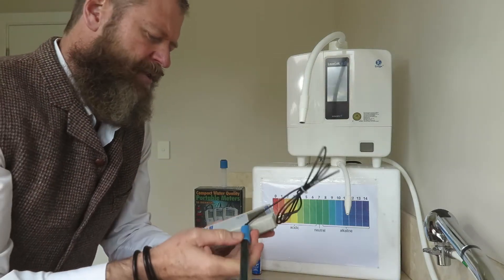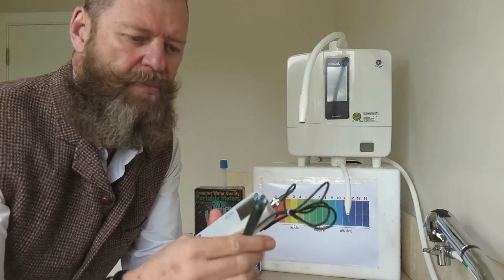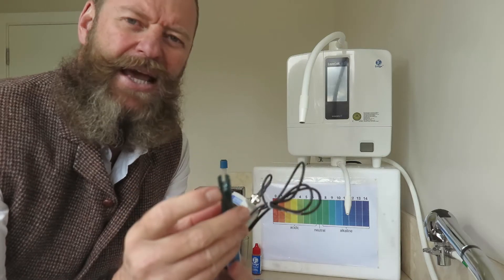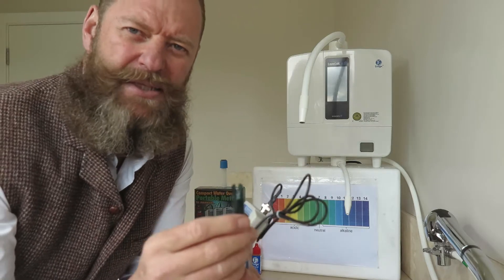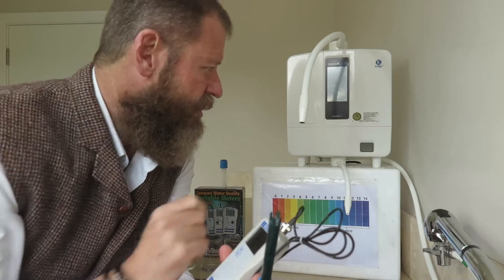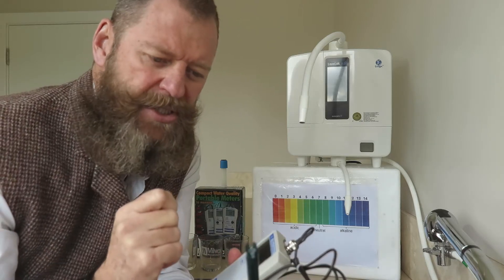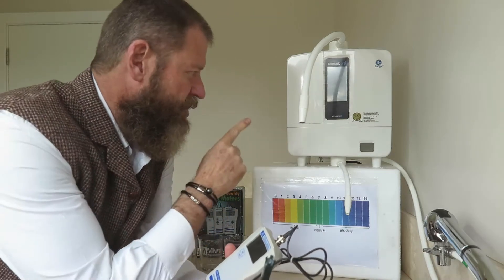I took it out of the box and before I use it I've got to calibrate it. Up at the top there is an electrode made out of platinum. It is corrosive if I'm going to be using the negative ORPs, hence I've got to put it in vinegar for 48 hours before I can even start using it. Today's presentation is about calibrating my machine so that I can use it for future presentations.